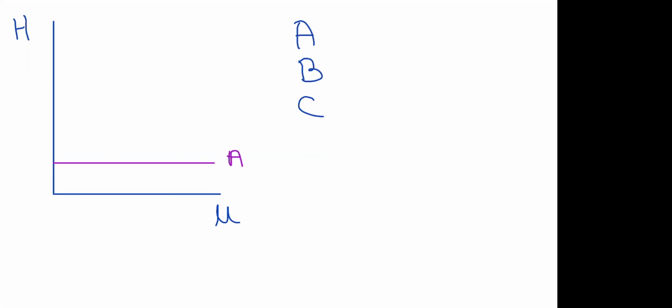And also the mobile phase is flowing so fast that the molecules are kind of focused. So the impact of the longitudinal diffusion is decreasing with the increasing mobile phase flow rate, and it is a roughly exponential decrease.